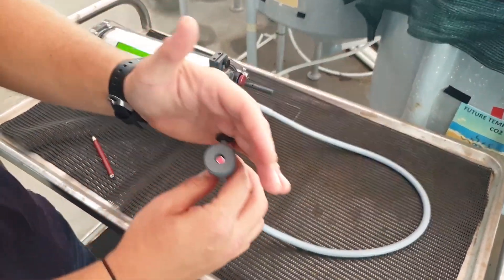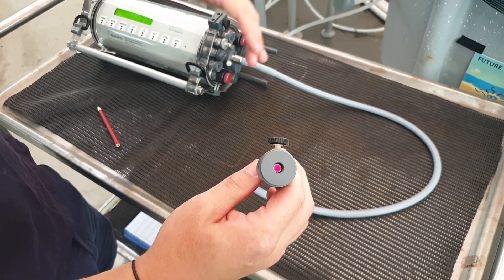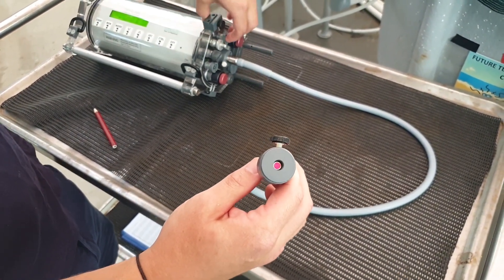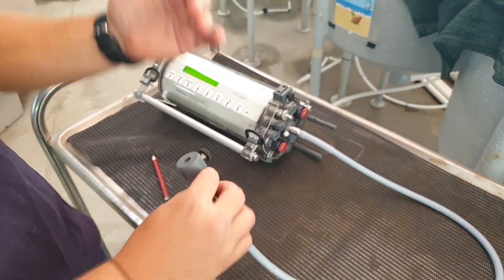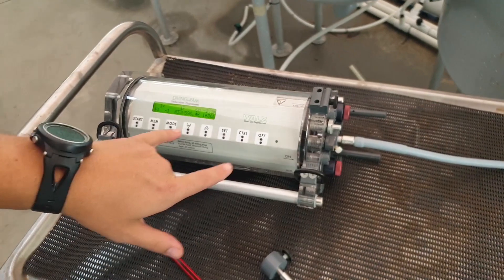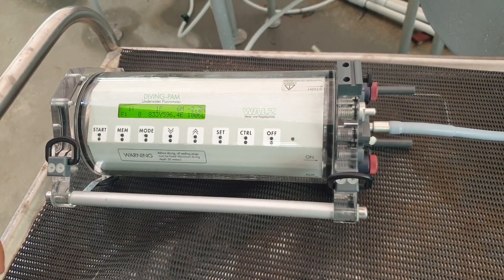Effectively what it does is it'll have a little background light. And when you want to take a reading, you do a pulse. It'll measure the plant at that lower state and then at the maximum fluorescence, and it'll give you a measurement based on that which you can use to compare the health of plants in a system.